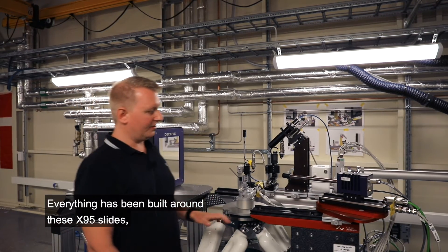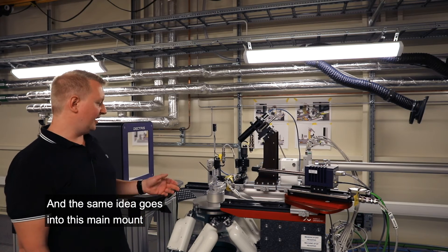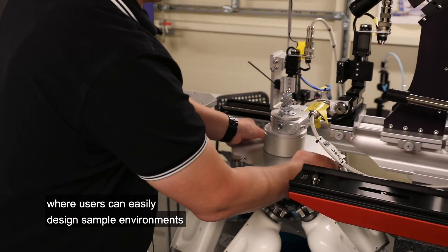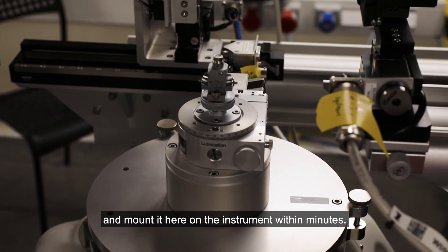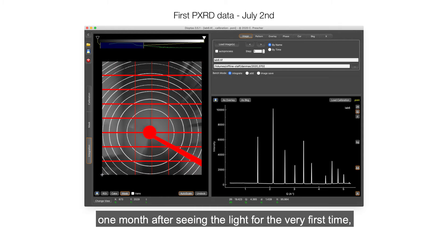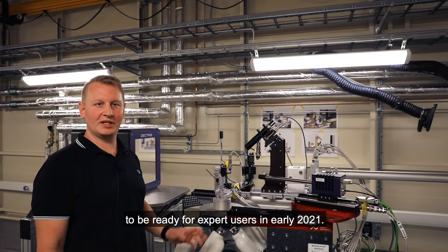Everything has been built around X-95 slides, so it's very easy to modify and change the configuration for different experiments. The same idea goes into the main mount for sample environments, where we've devised a kinematic mount where users can easily design sample environments with the corresponding mount and mount it on the instrument within minutes. We took the first powder diffraction data on this instrument in July, one month after seeing the light for the very first time. Here in the fall, we are continuing with the commissioning to be ready for expert users in early 2021.